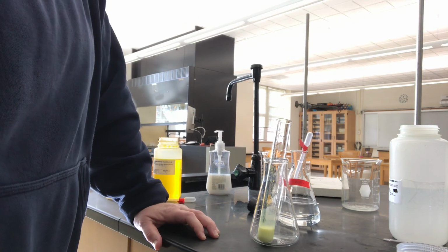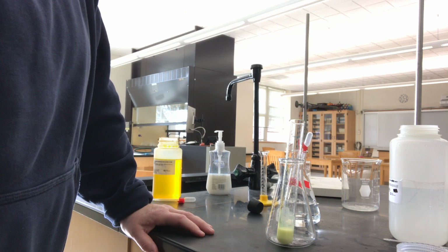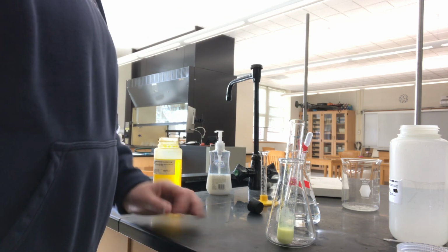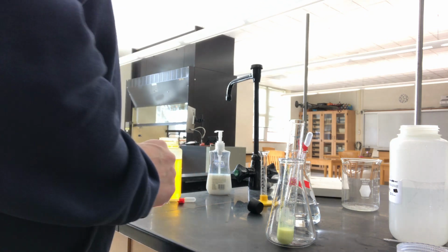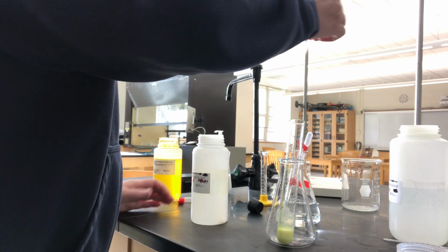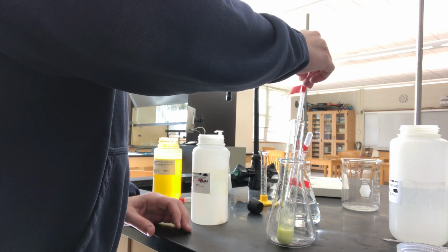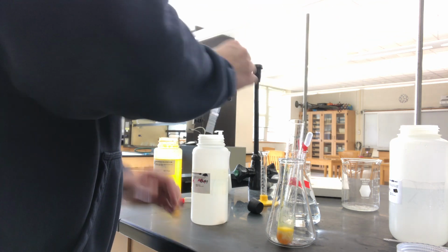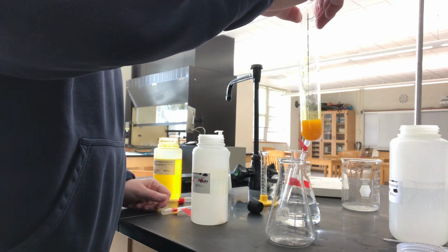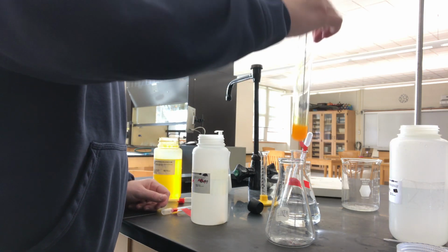So that barium chromate is in equilibrium with its ions. Okay. Now what we're going to do is add a little bit of HCl and disrupt that equilibrium. Let's see what happens. Okay, so add a little bit of hydrochloric acid, and we got orange. Okay. So it turned it from yellow to orange.